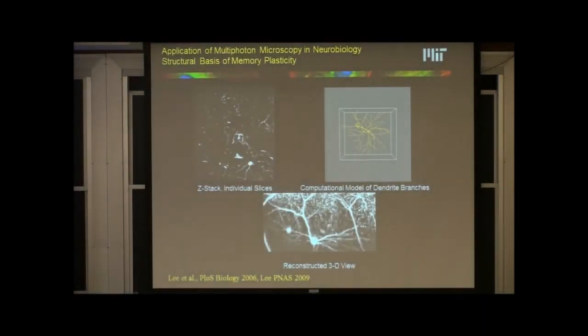Okay, so last image, so that I don't take up the Pan's time, is if you take a look at what you can image with endogenous signal, that works pretty well. But I should point out that if endogenous signal works very well, if you express GFP and put in exogenous signals, you can certainly do better. So this is something that we do very routinely today. Many of you guys would be in Ellie's lab this afternoon or tomorrow. We image through the head of the mouse by putting a window on the skull, actually 2 windows on the skull, and that allows us to image into the brain and looking at GFP expressing neurons.